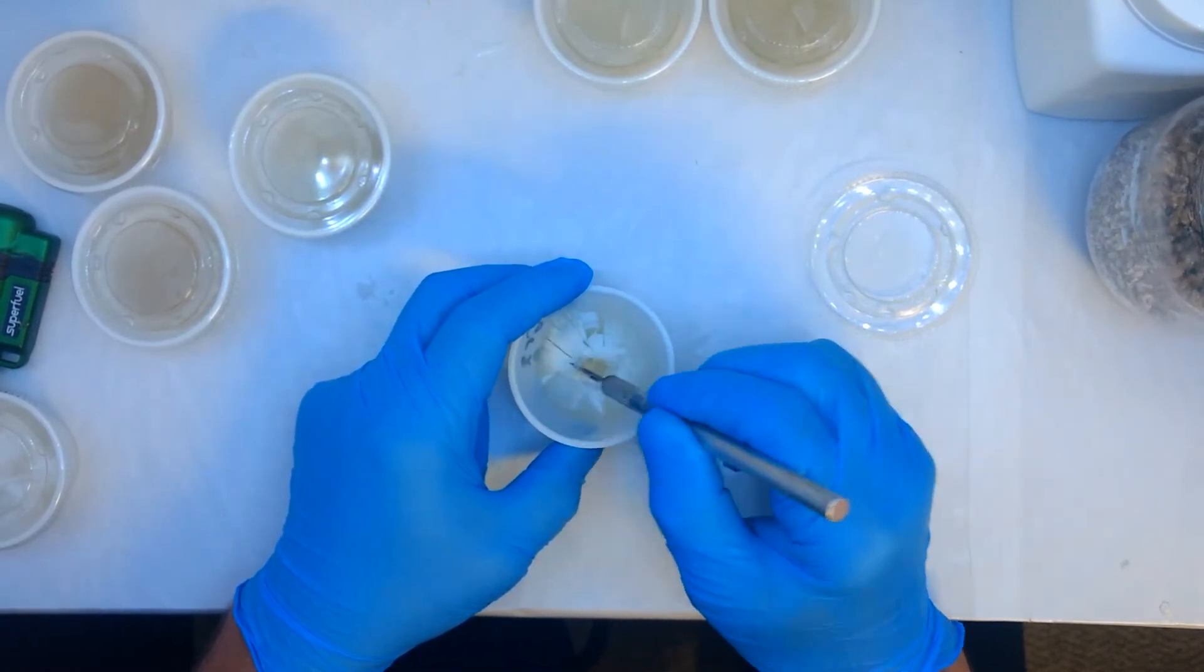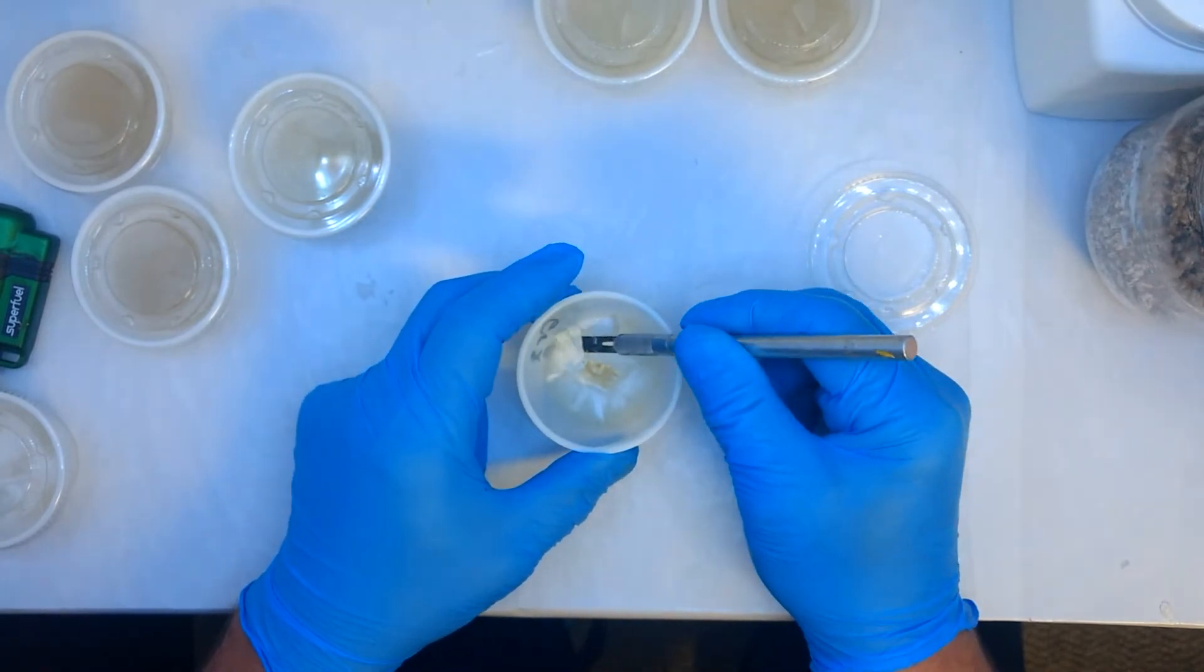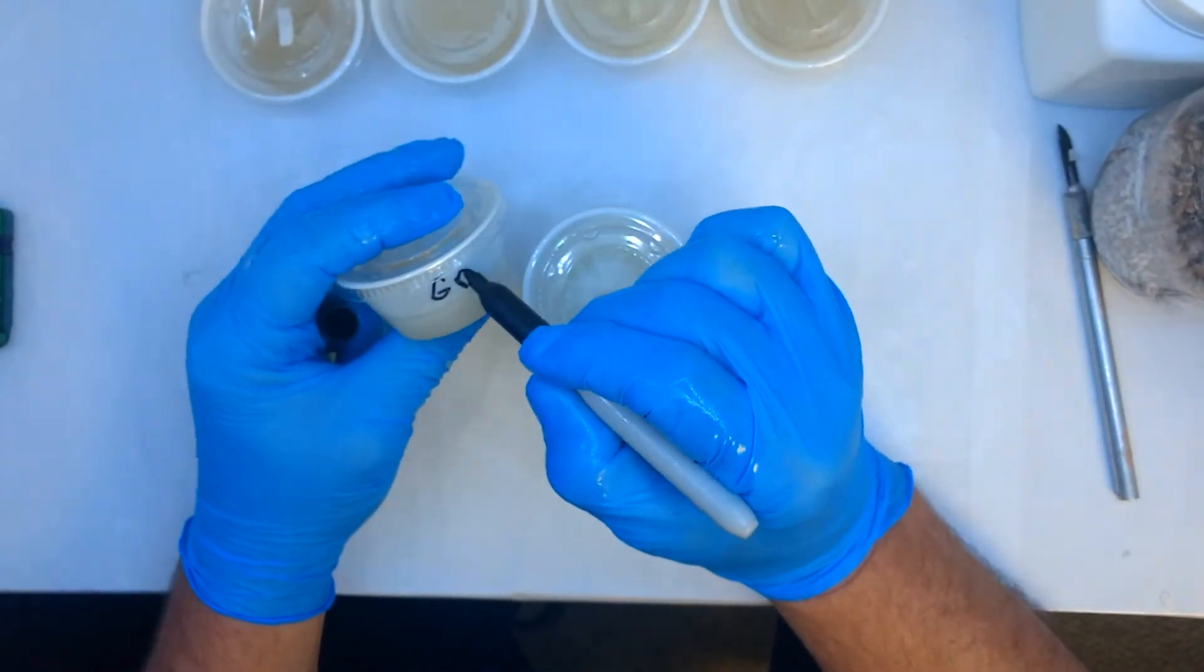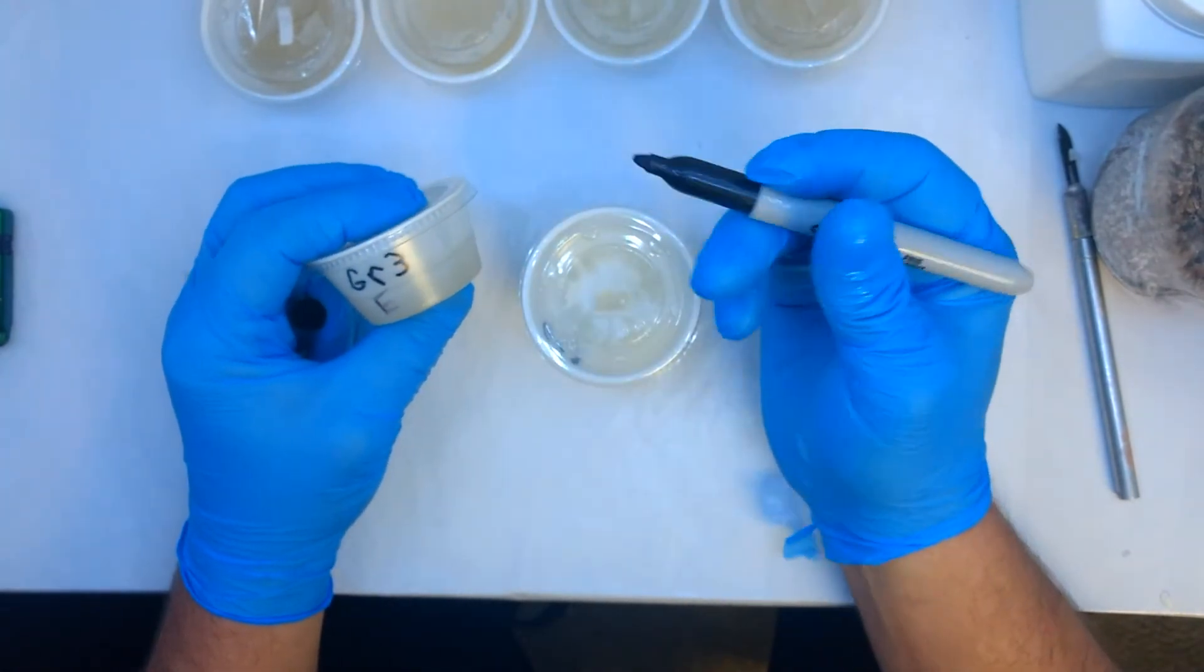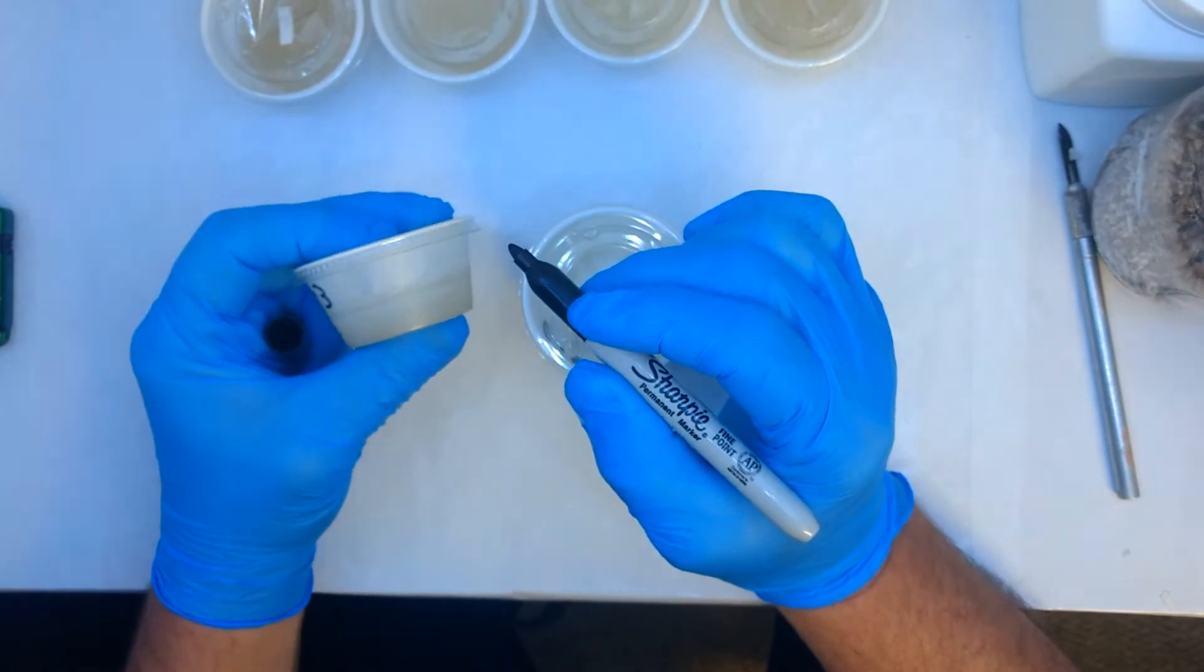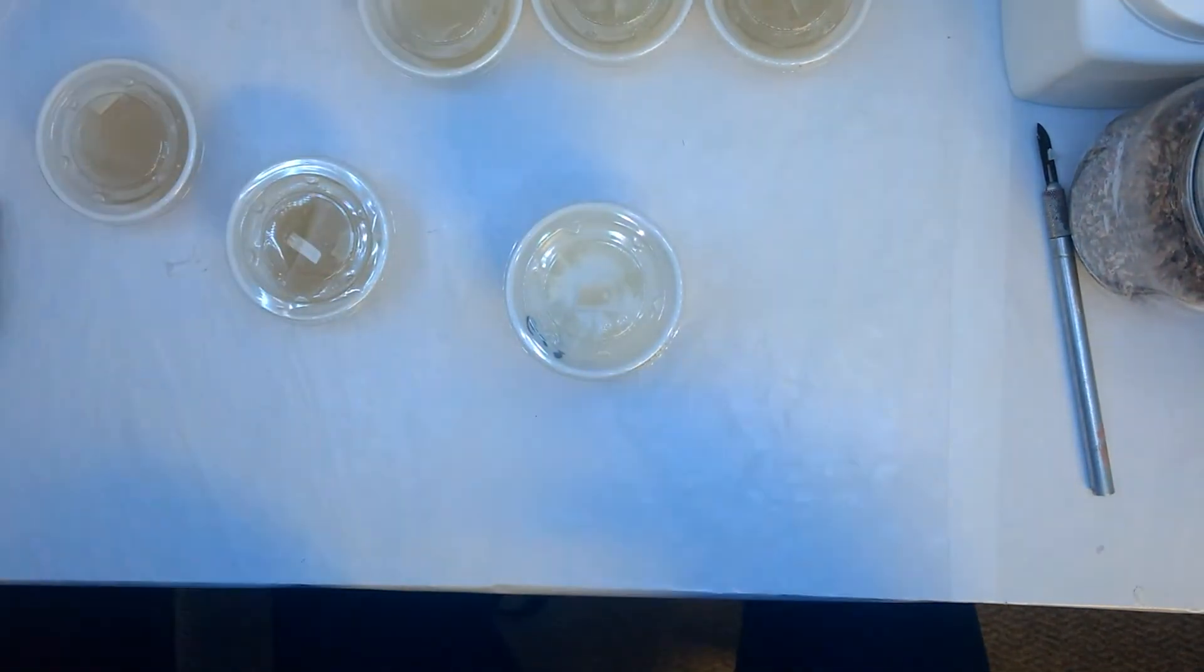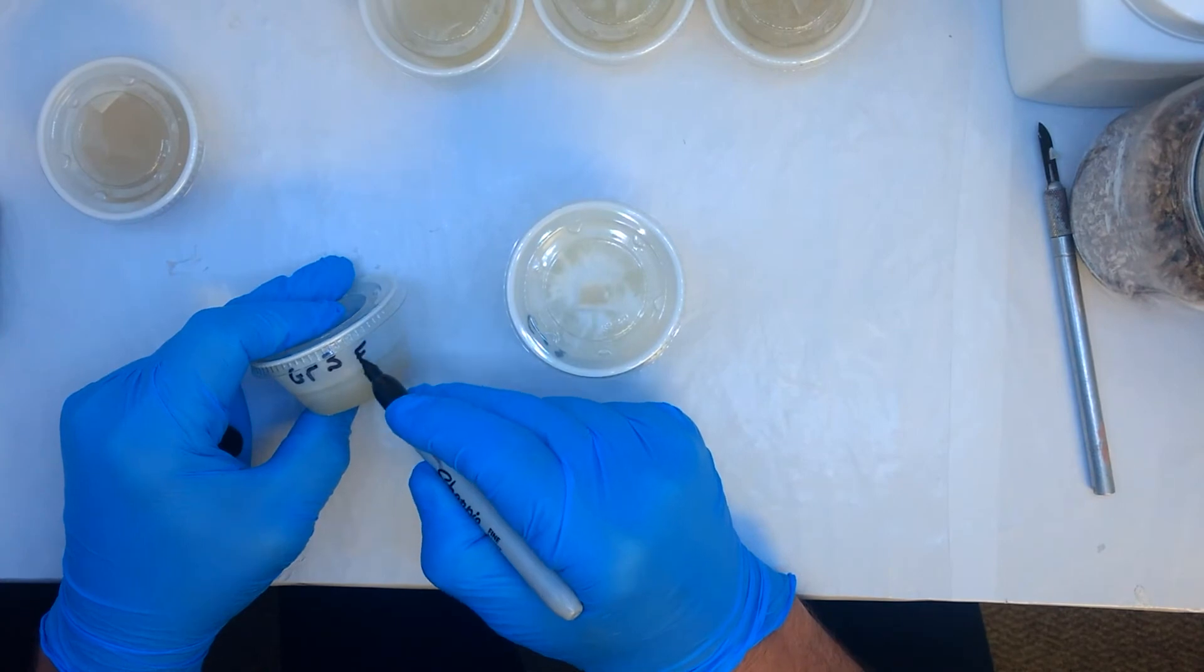Once you're done making your agar sectoring plates, you want to label everything properly with the strain and the version. So this is Grain 3, this is the third time I've sectored it, and the date of course, you always need that. You also want to keep a book of acronyms on hand like I do.